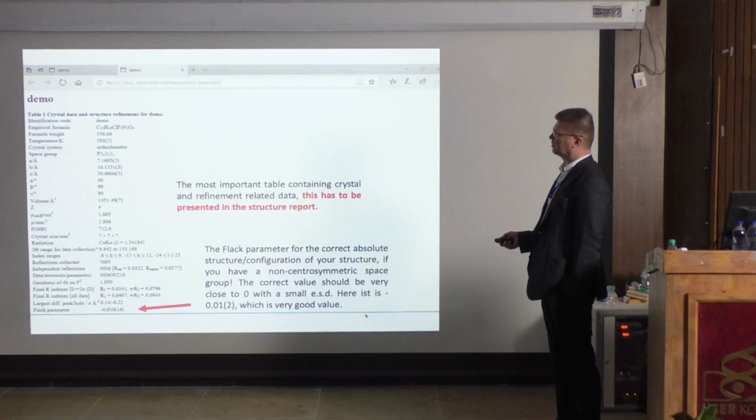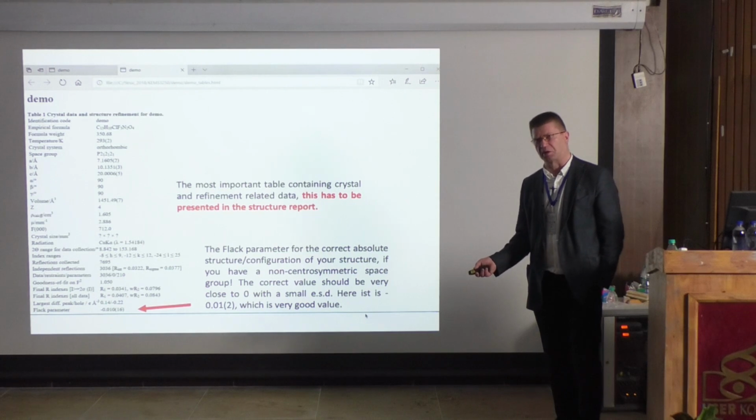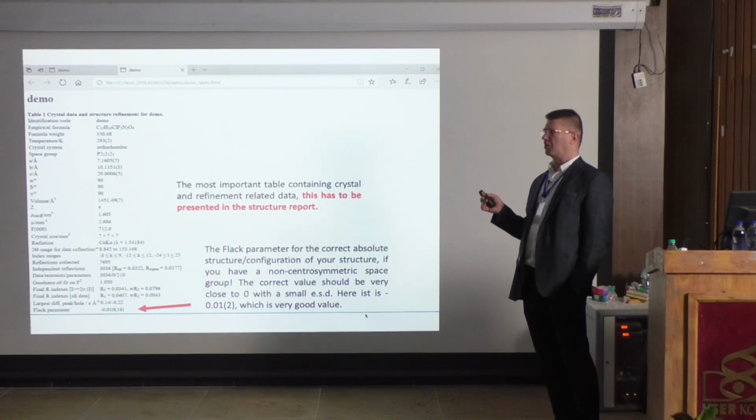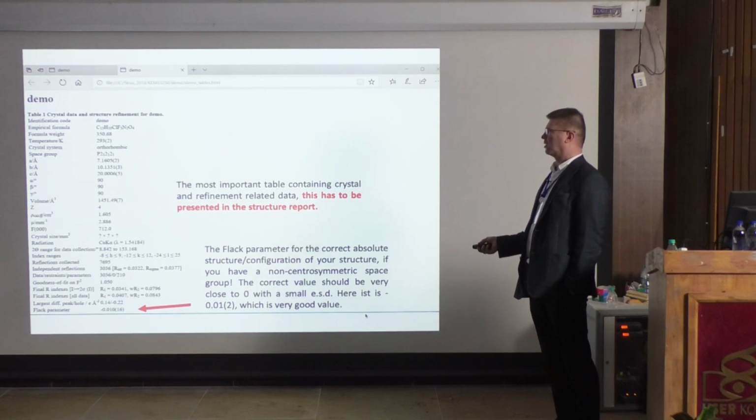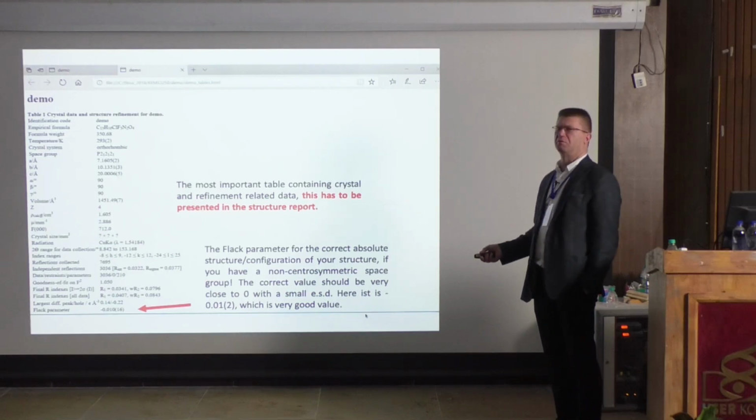It's not so important. So what are important is the unit cell, of course, and then the space group, and then the molecule itself. And then crystal size, we didn't indicate the crystal size, but this is crucial information. So when you are putting a report up or so on, you always have to measure the crystal.